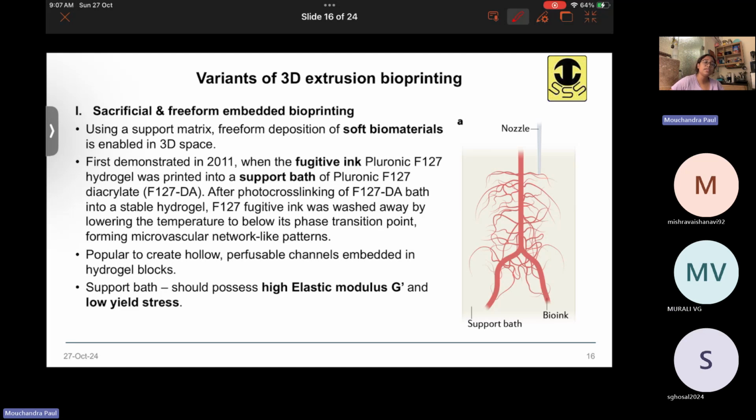So these are all constraints that you have: the type of the tissue, the type of the cell, the availability of the material, the type of the machine you're using. So all these constraints are there in front of you, and then you make your best decision possible. But what I have discussed now is the technology that is available for bioink design. But for every researcher and their application, they can combine either 2 or 3 of the methods together, okay, or they can use one method individually.